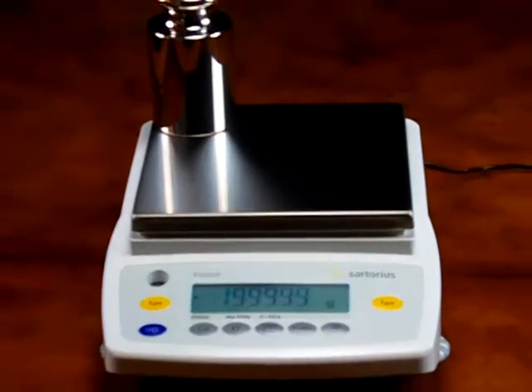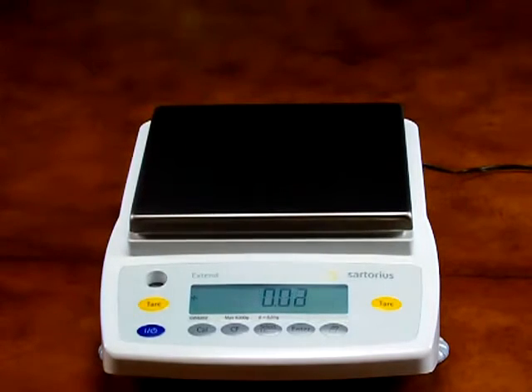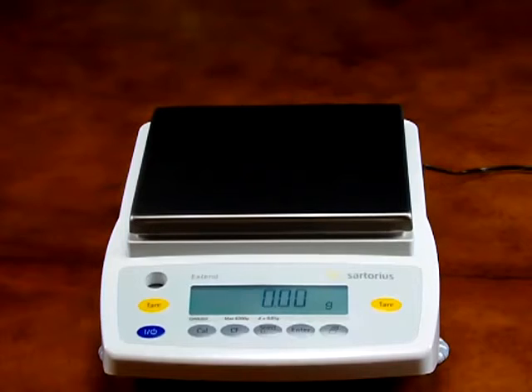This balance is manufactured in Arvada, Colorado by Sartorius. All parts and components come from Sartorius AG.